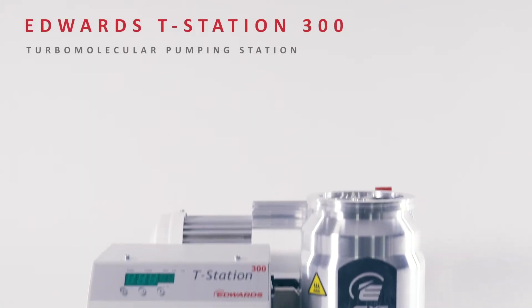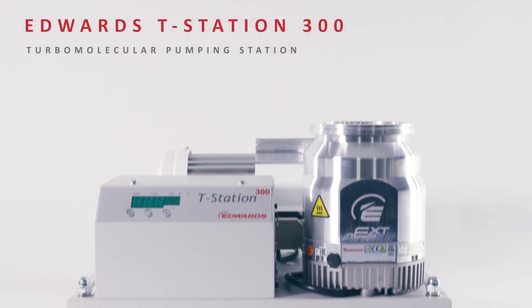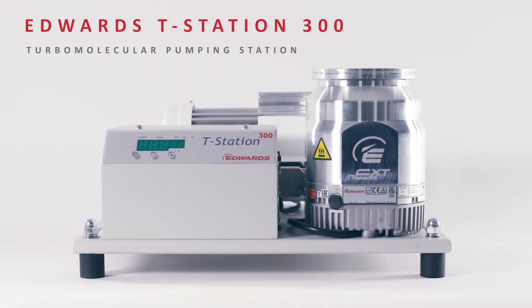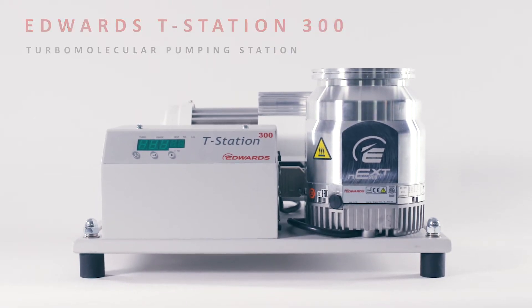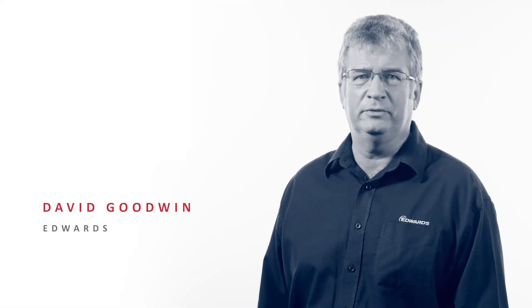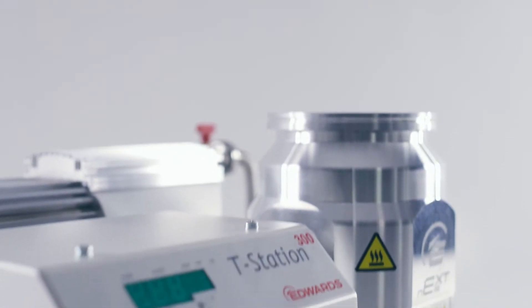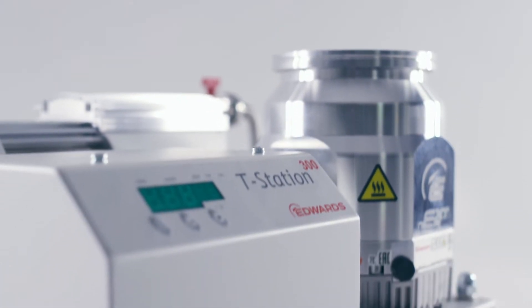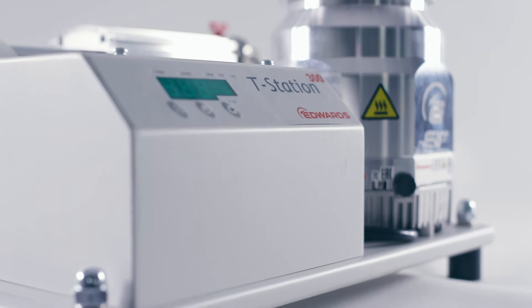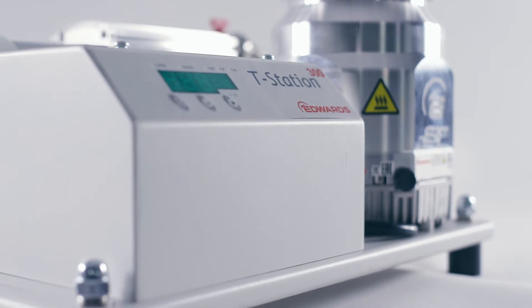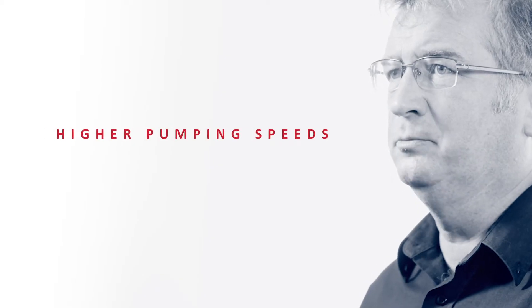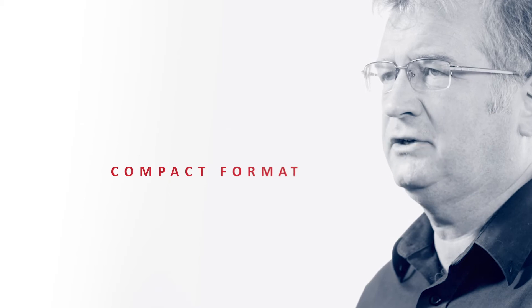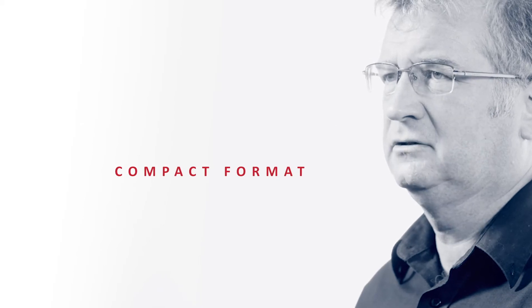The new Edwards T-Station 300 is a further extension to our comprehensive range of popular turbomolecular pumping stations. T-Station 300 builds on the experience of our established T-Station 85. It offers higher pumping speeds in the same compact format.